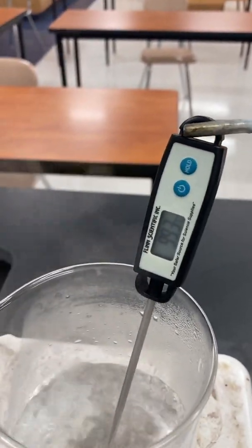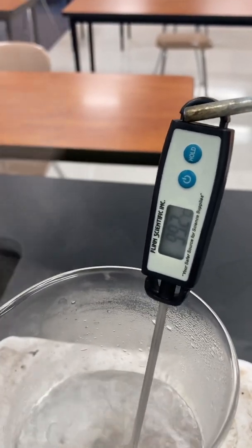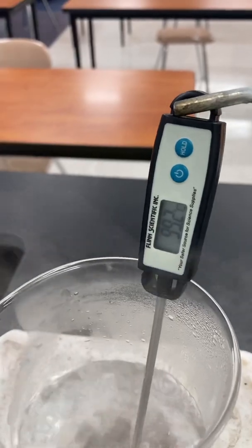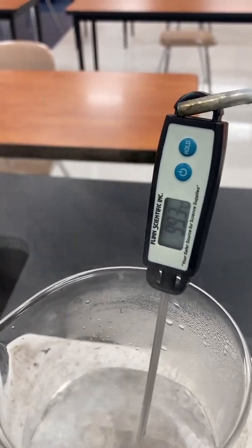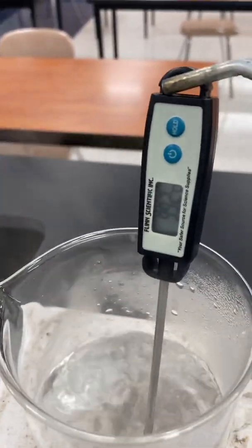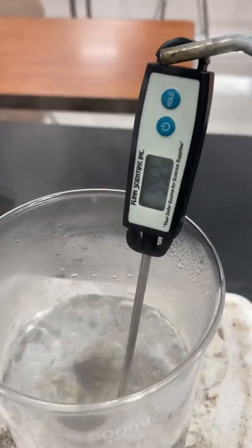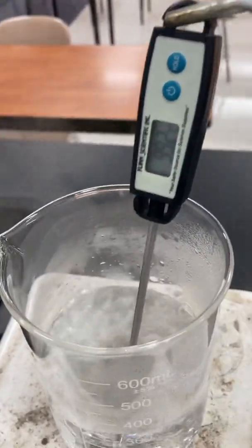Again, this could just be a flaw in the thermometer. Water usually boils at 100 degrees Celsius under perfect conditions with perfect water, perfect thermometers and everything. And look, I'm adding heat to this water, but it is no longer going up. So at 12:30, our temperature was still 99.3 degrees Celsius. Let's just go for another minute here and see what happens to temperature.